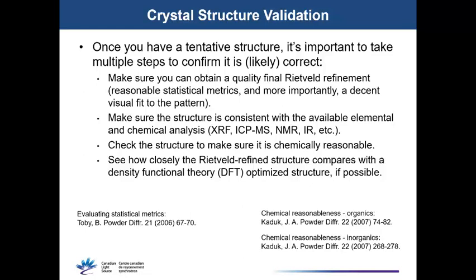You want to check the structure to make sure that it looks chemically reasonable. This is another thing that comes with experience. My background is actually in engineering physics rather than chemistry. I joke with my friends that I've basically been an untrained chemist now for about 10 years. But it takes looking at some of these things, particularly if you don't have a chemistry background. You've got to look at them for a while to figure out, okay, what is reasonable? What kind of bonding patterns are reasonable?